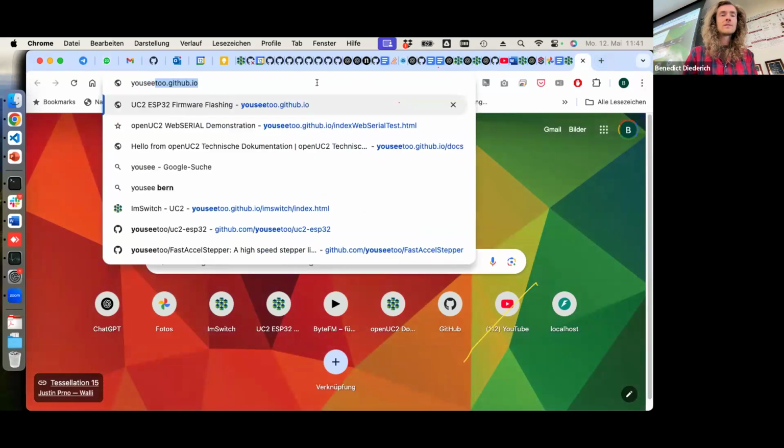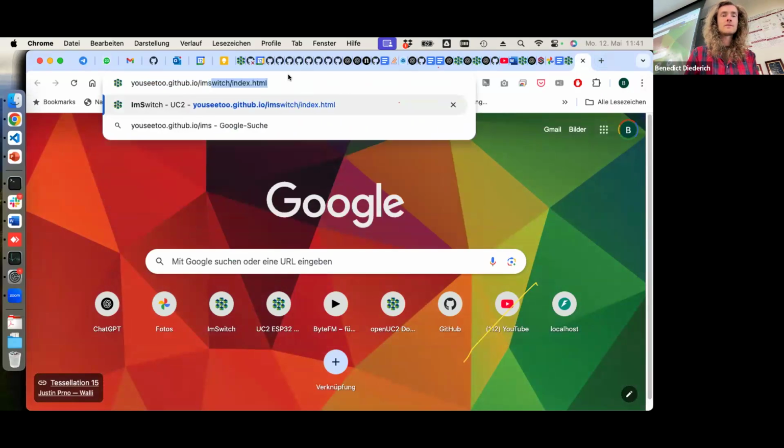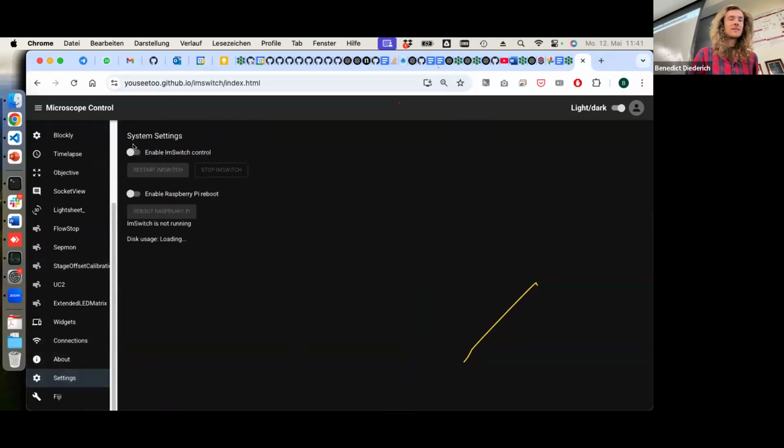So the system settings, so that you can at least restart stuff. But I didn't think about the Docker. That's very interesting, so that you restart the Docker compose. There's a Docker command you can run to restart any container from within the running container. I mean, you would run a command, docker restart container name. Okay, yeah, that would be very helpful.